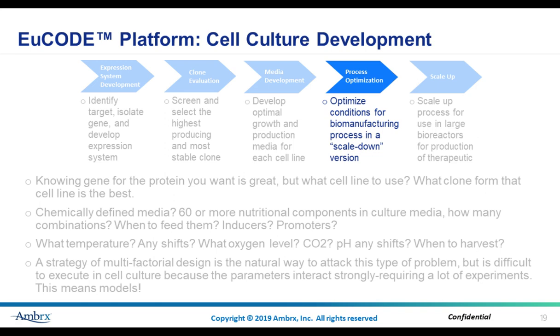Normally, process development is divided into an early and a late stage, with each having different goals. The goal of early stage development is to rapidly develop a bioprocess to produce material for phase 1 and phase 2 clinical trials and tox studies. Standardized process conditions and procedures are essential. The process may not be fully optimized for every molecule. As the product moves into late-stage development, the process can be further optimized.